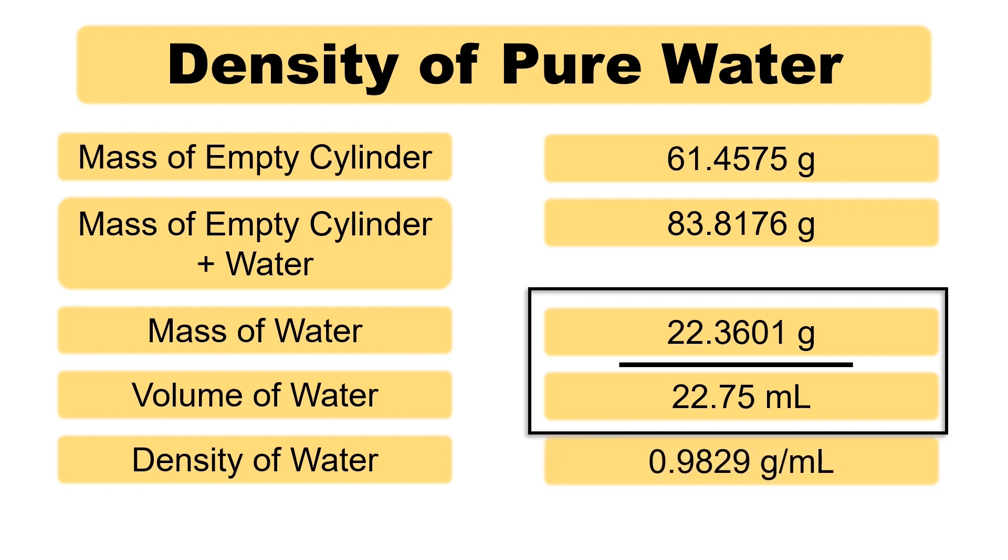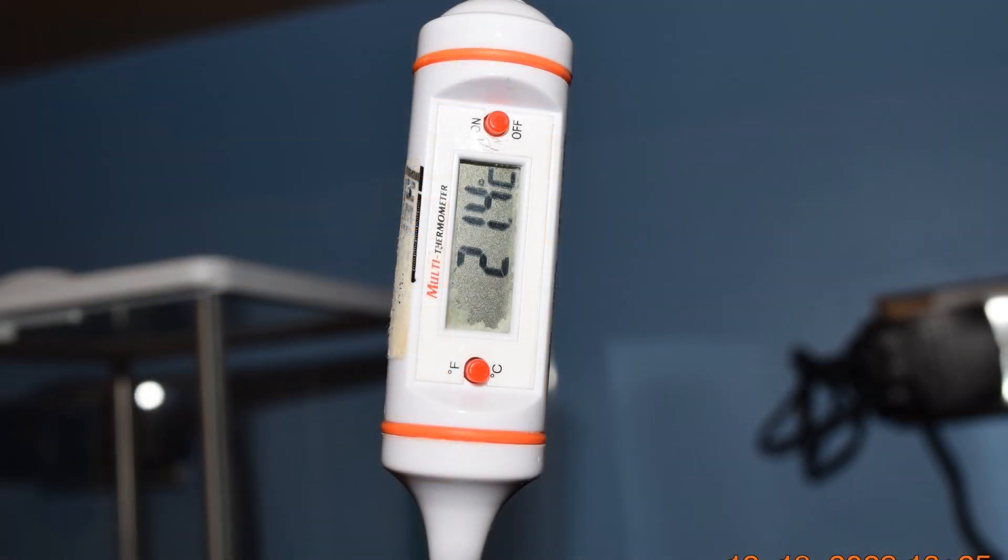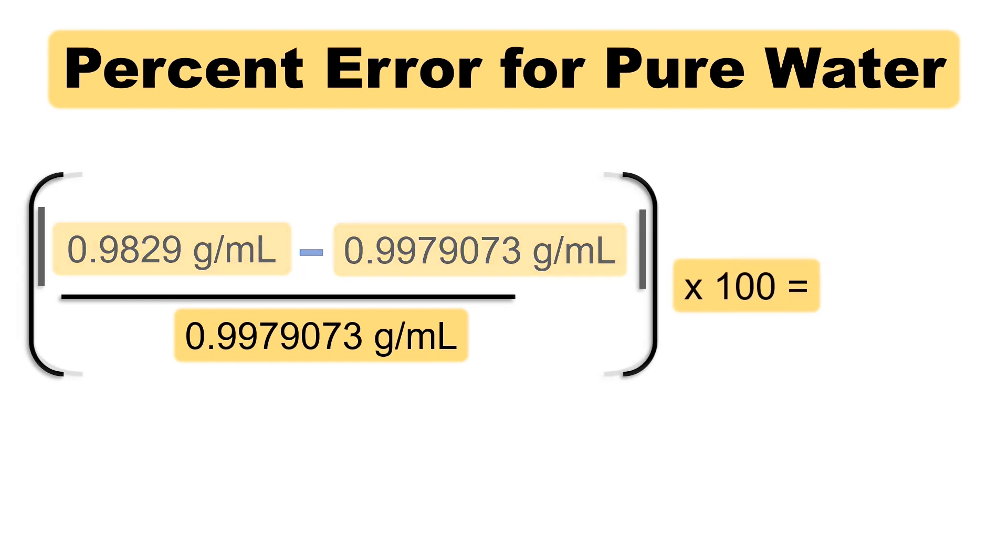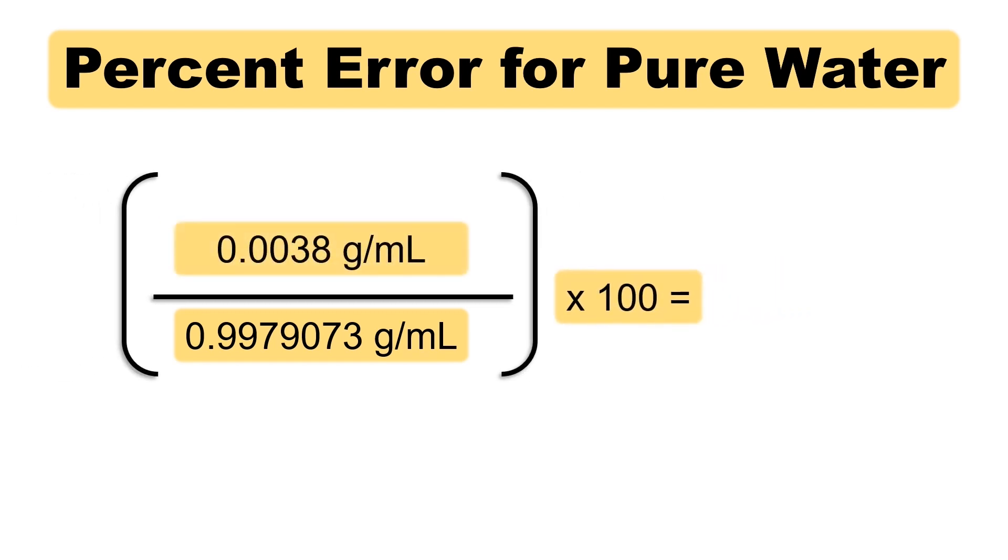Let's find our percent error for pure water. I'll measure the temperature of the pure water because the density is dependent on the temperature. At 21.4 degrees Celsius, water has a density of 0.9979073 grams per milliliter, according to the CRC handbook. Following significant figure rules, we see that the percent error is 0.38%. Yes, less than a 1% error. Using the more precise graduated cylinder improved our measurements.